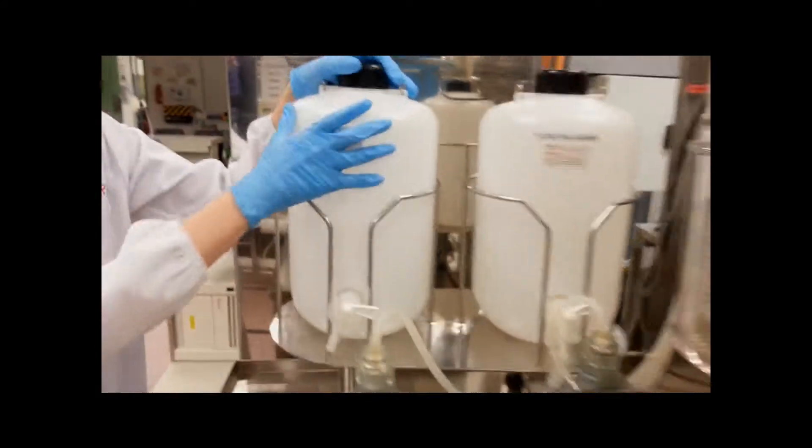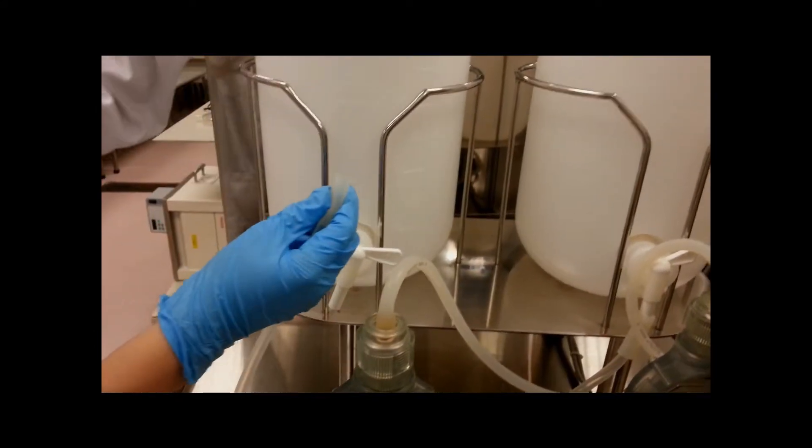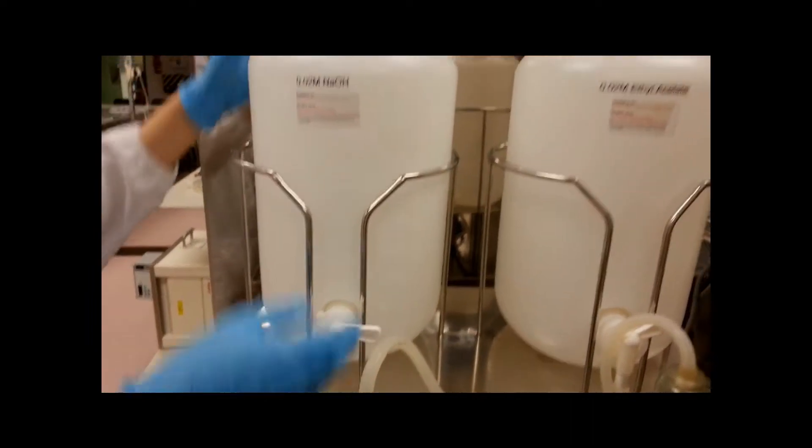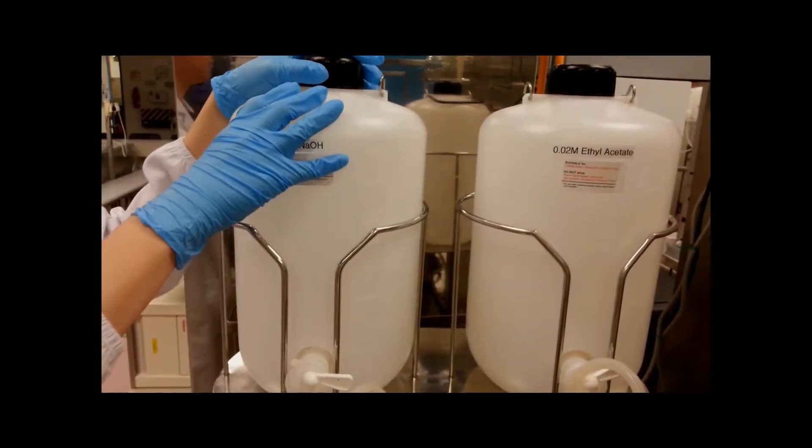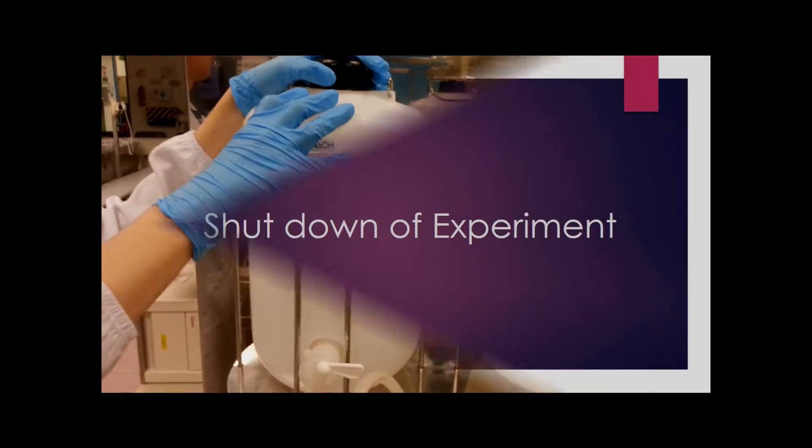Followed by that, you are required to remove the piping from the reactor tanks and to dispose of the solution within into the correct bin which is guided by the TSOs.